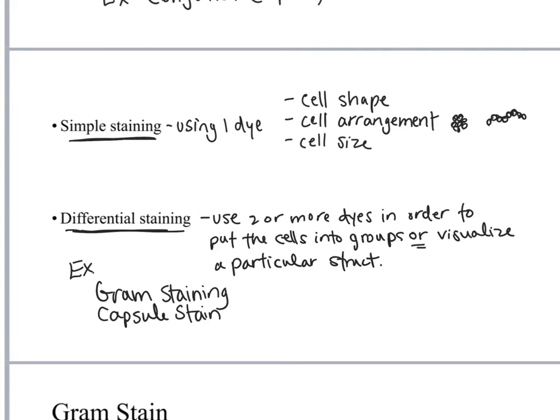If we have time after Thanksgiving and we're still meeting in person, we will do an acid-fast stain as well as a spore stain. Acid-fast is a category of organisms with a specific kind of cell wall that's not really gram-positive or gram-negative, so we use a couple different dyes to see if the cell is in that acid-fast group. A spore stain, again, is for another particular structure. I lobbied hard for us to find time to do those. I didn't win. We're going to do that after Thanksgiving again if we are still meeting in person.